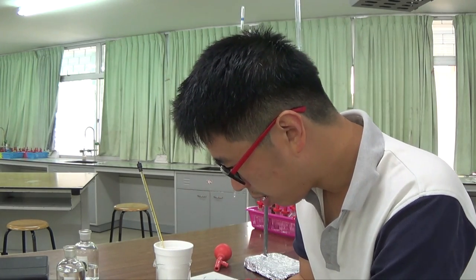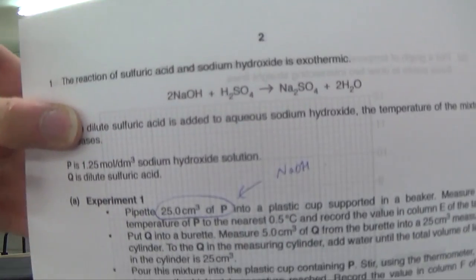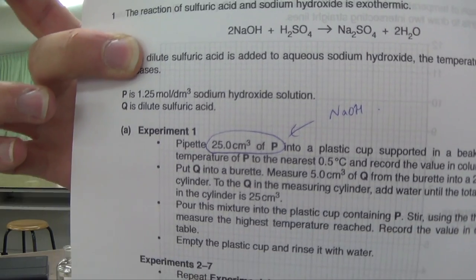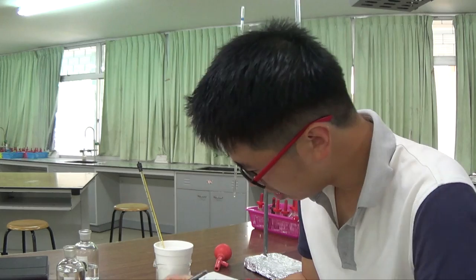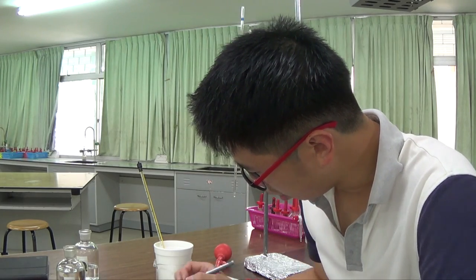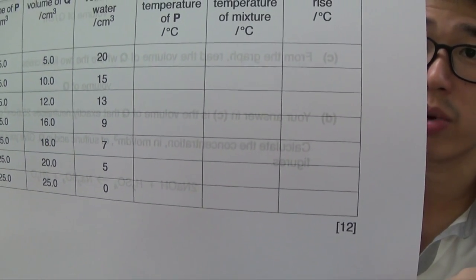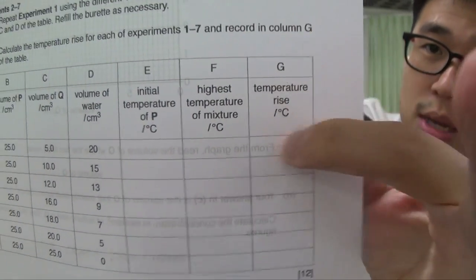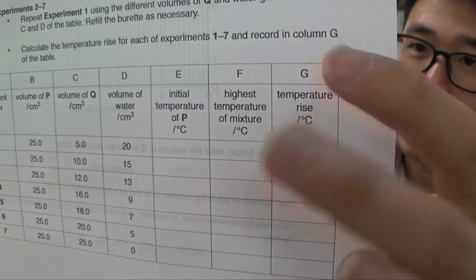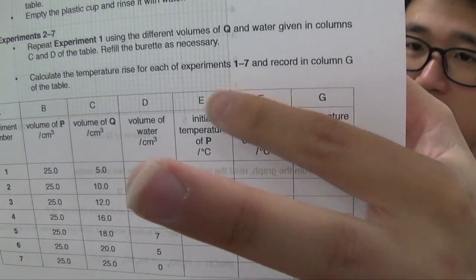It says measure the temperature of P to the nearest 0.5 degrees Celsius. Record the value in column E of the table. So you have the initial temperature, and you have the highest temperature reached, and then you calculate the temperature rise. Your thermometer will not tell you the temperature rise. This is what you record on the thermometer, and this is what you calculate based on this and this.